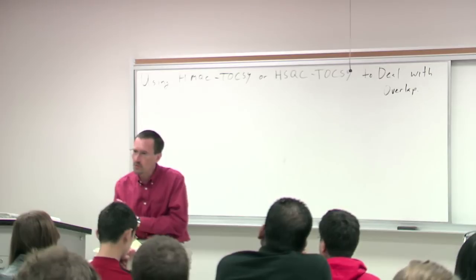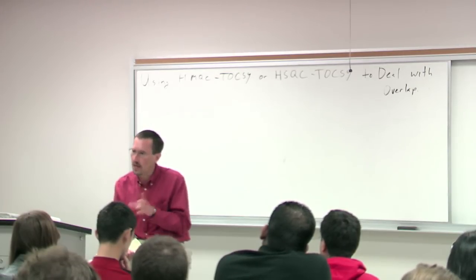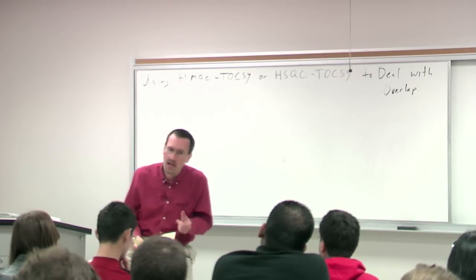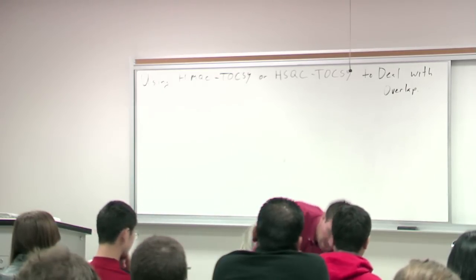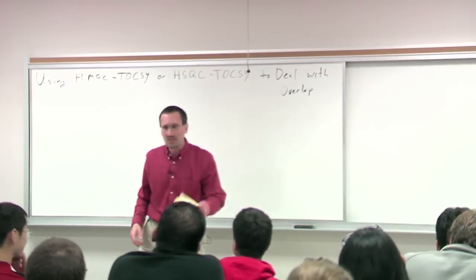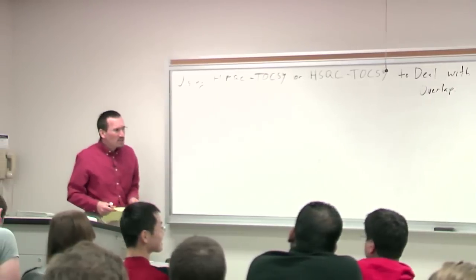As it turns out, we tried to implement both the HMQC and the HSQC, and the HSQC-TOCSY ends up being a little better for this. And in fact, right now, Ryan's working up an example of this for the final exam. So I do think what we're talking about is important. All right, we've gotten to a point.